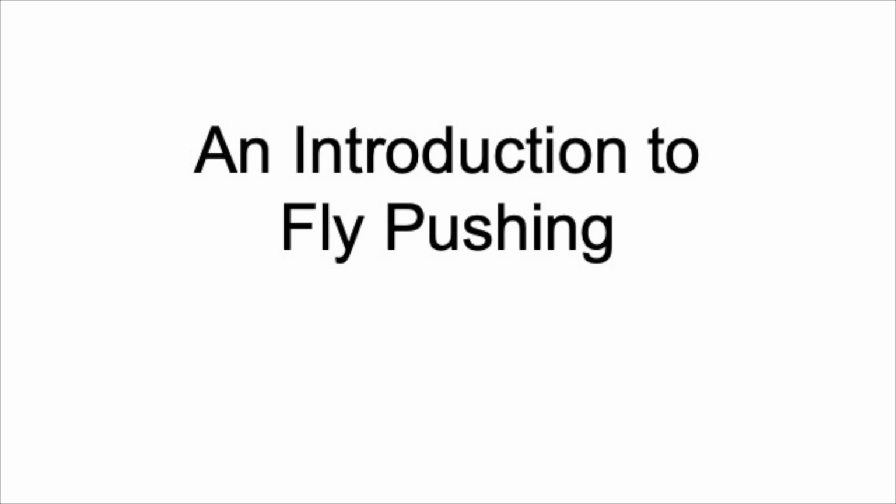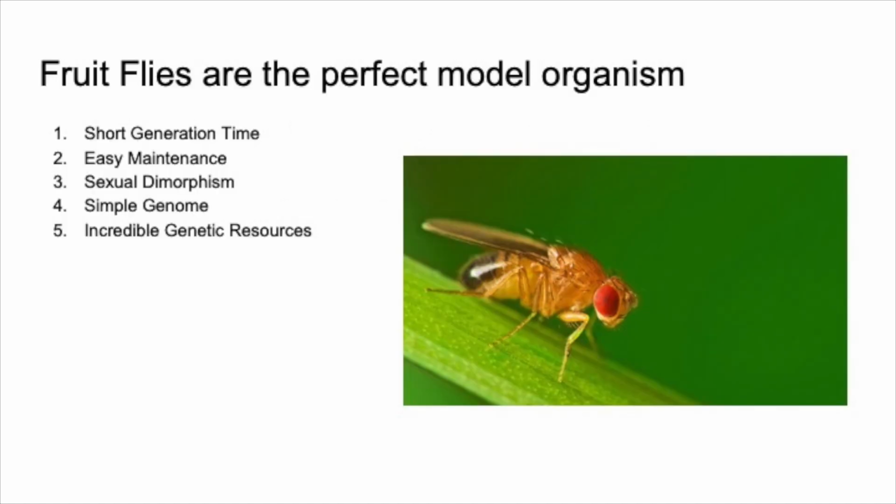In this video, I'm going to introduce you to Drosophila melanogaster and cover the basics of how to work with fruit flies in a laboratory setting. Fruit flies are an incredibly powerful model organism and can be used to answer a huge variety of questions.